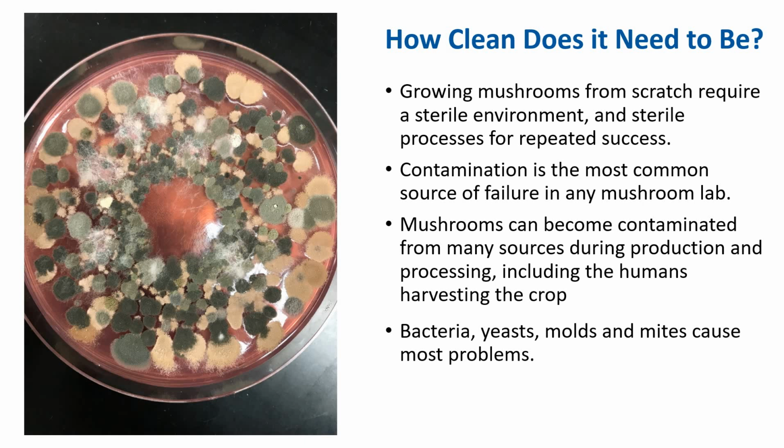So you might be wondering, why is this even necessary? Doesn't mushroom grow in a non-sterile environment in the wild? Well, wild mushrooms grow in a balanced ecosystem where the environment favors their growth. You cannot create this complex, balanced environment in your home. So if we want to cultivate mushrooms predictably and repeatedly, we need to keep it clean.